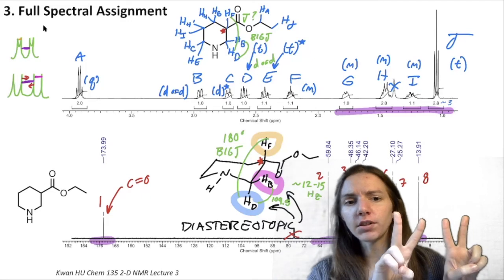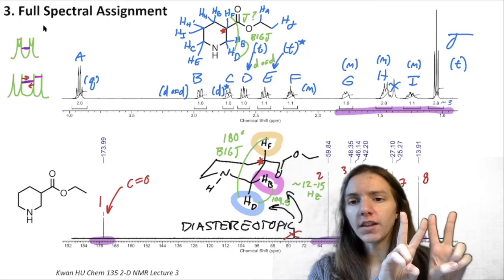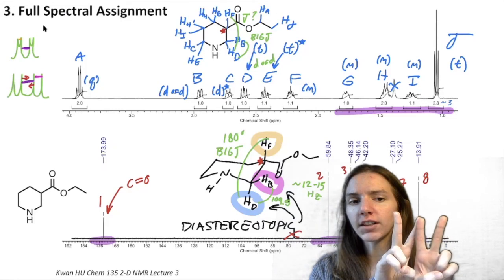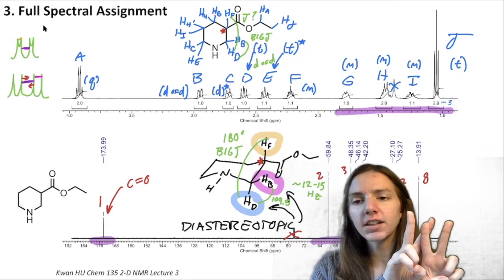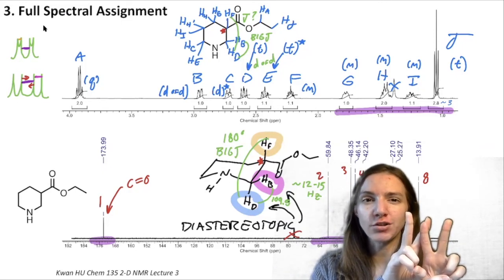If we take our doublet of doublets like so, and we move them closer and closer together based on the J splittings, at some point it stops looking so much like two doublets and it starts to coalesce together to form what looks more like a triplet or kind of a W shape. And then if you keep going, you start to see these two peaks emerge again. And that's where we get that fine splitting of that central portion of the peak. So hopefully this gives you a little bit better of an idea than that bad cartoon I just drew did.